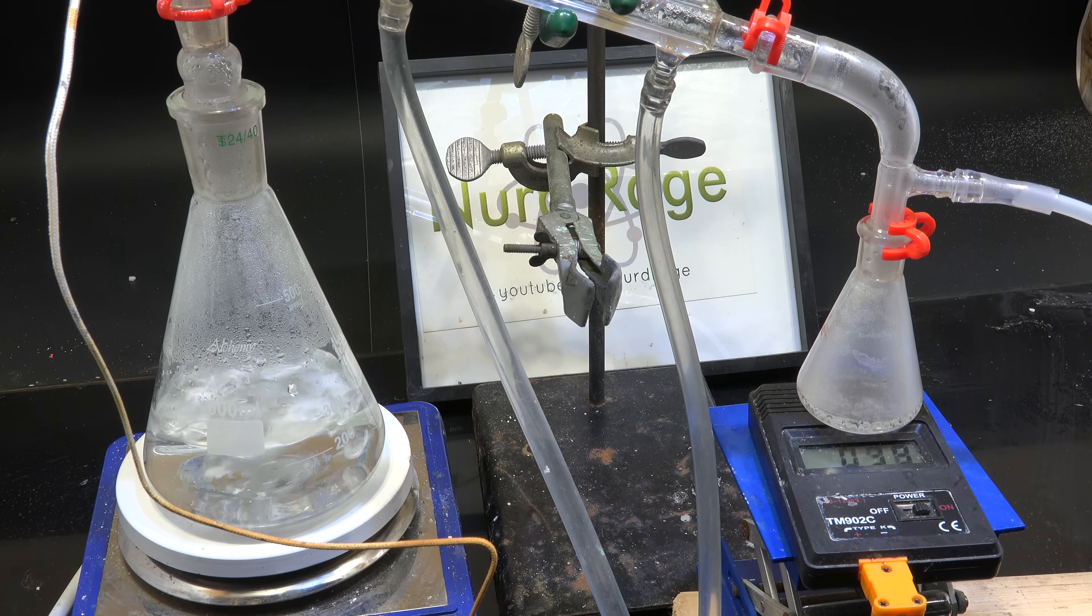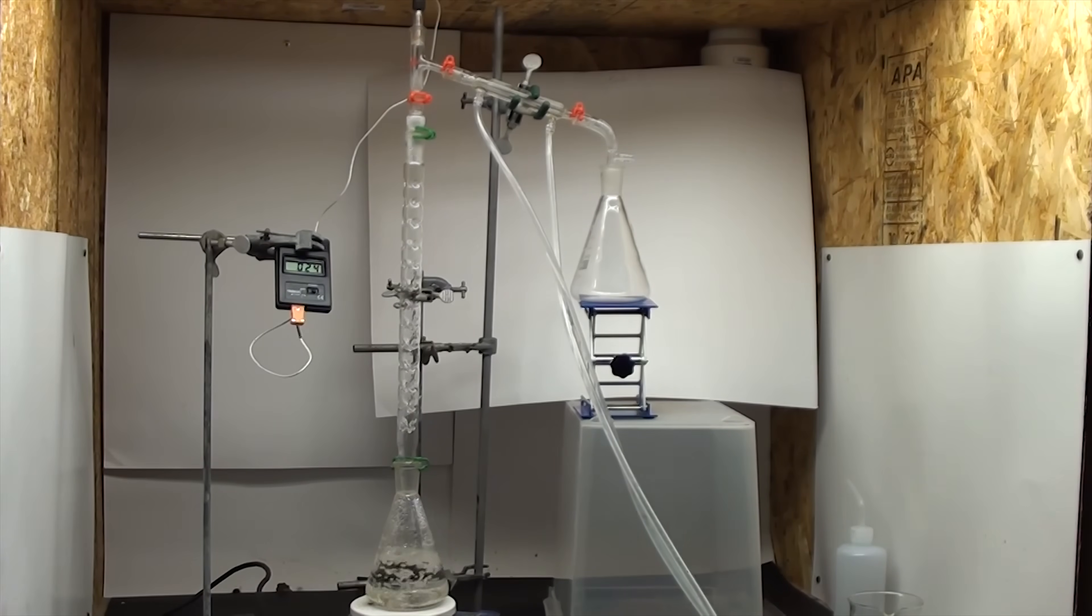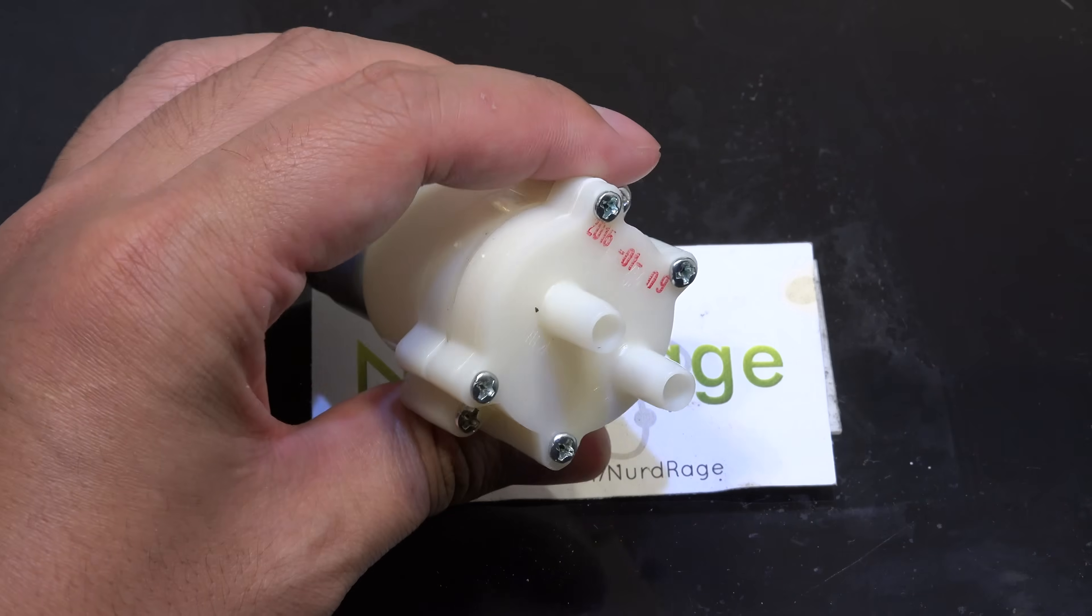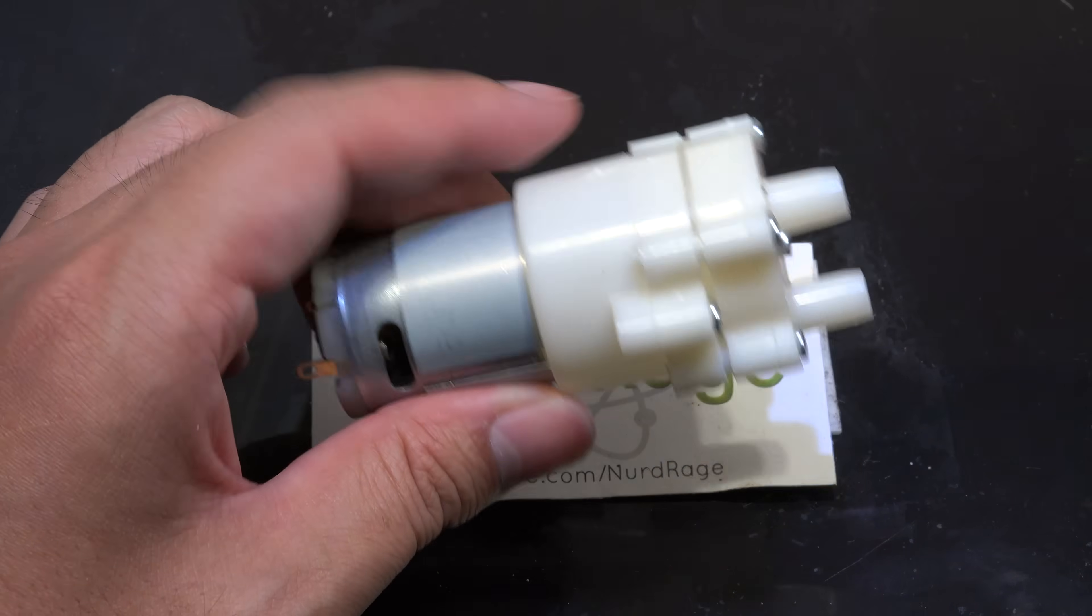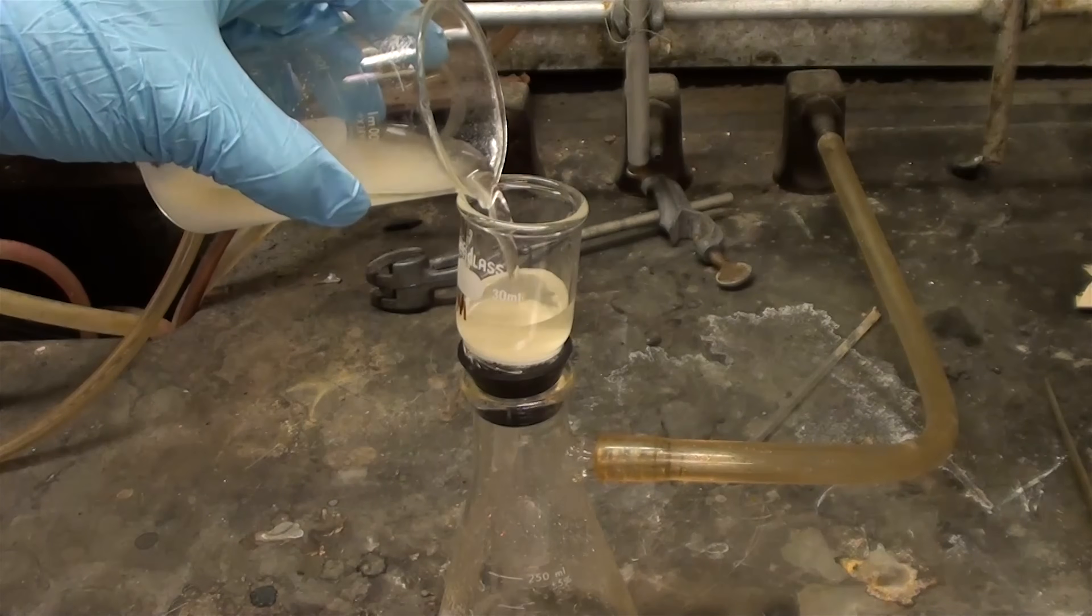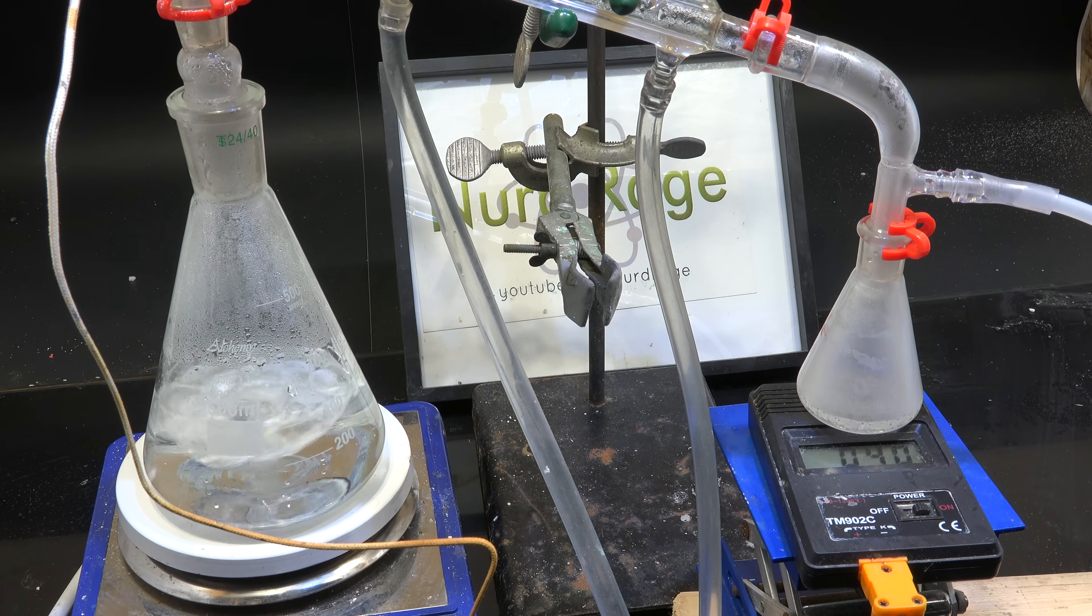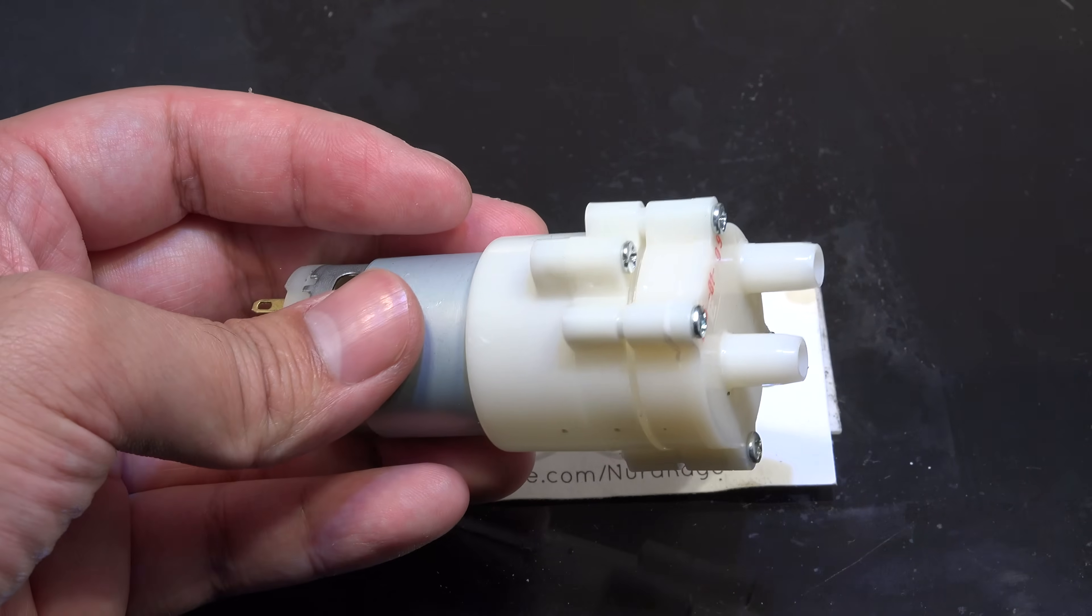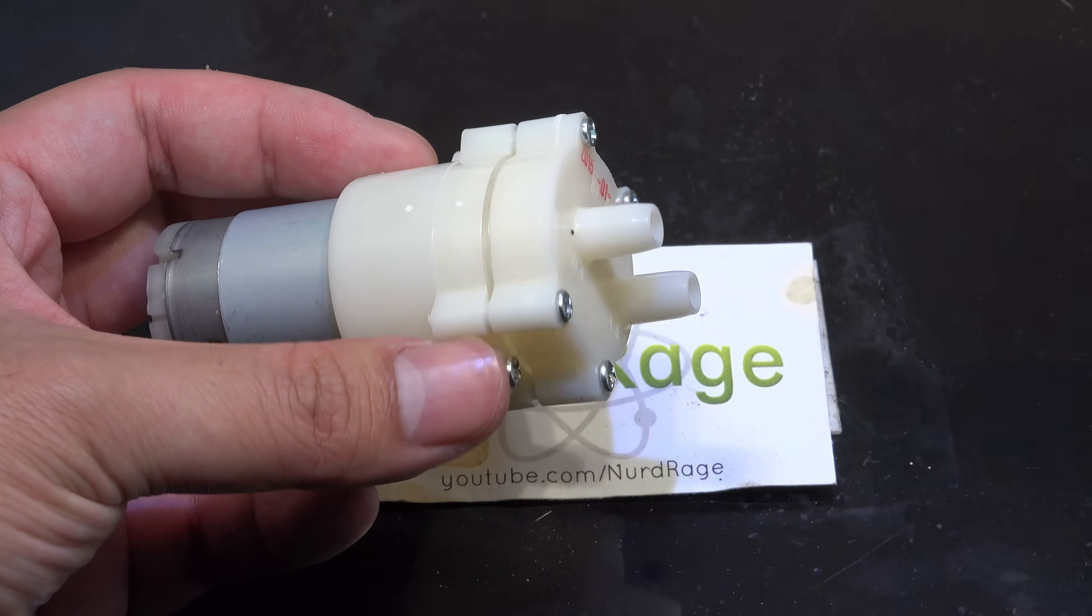This is especially useful if you're boiling chemicals with very high boiling points or getting around azeotropic mixtures. Now I've shown previously these cheap six dollar nylon diaphragm pumps. They are primarily useful for moving gases at atmospheric pressure like an electrolysis box or for filtration, but they're ineffective for distillations or chemical drying. They are cheap however, and even if you destroy them with solvent vapors it's not much of a hassle to buy a replacement.